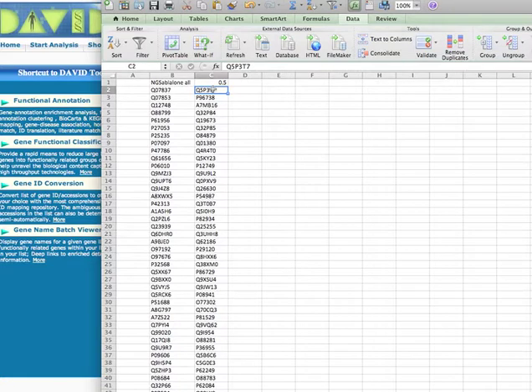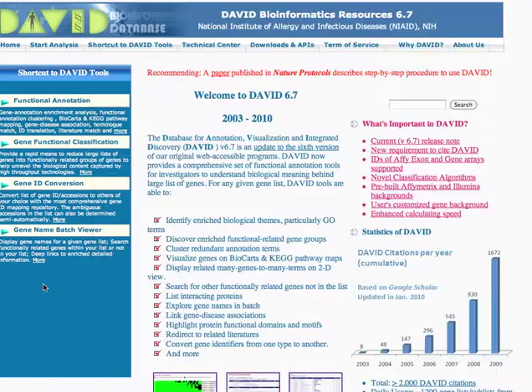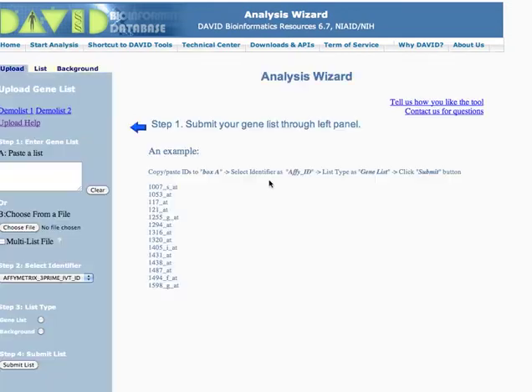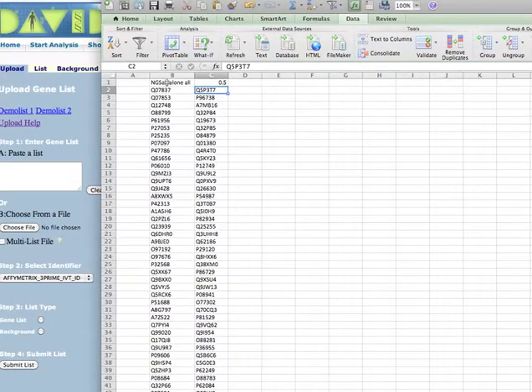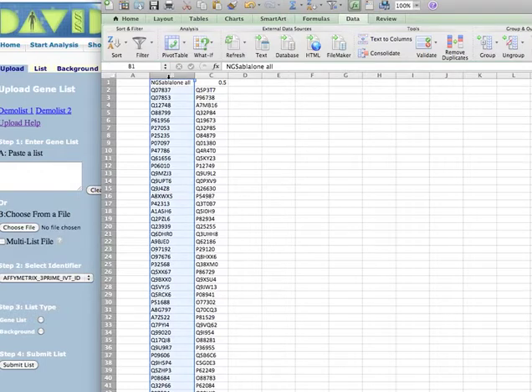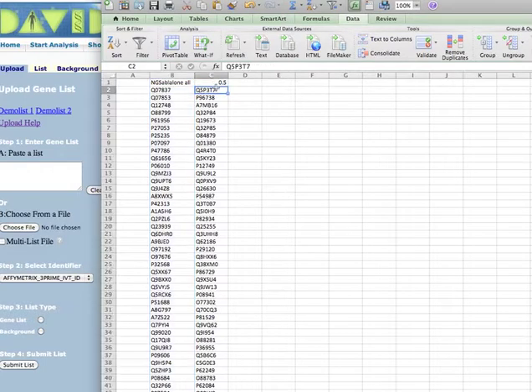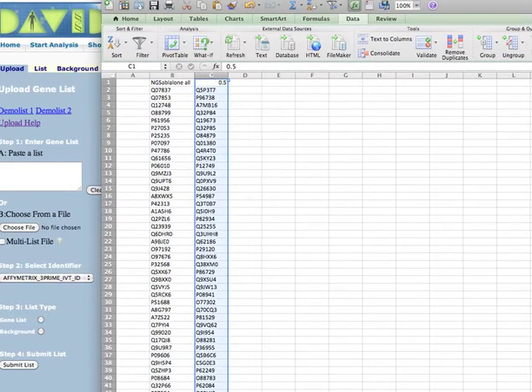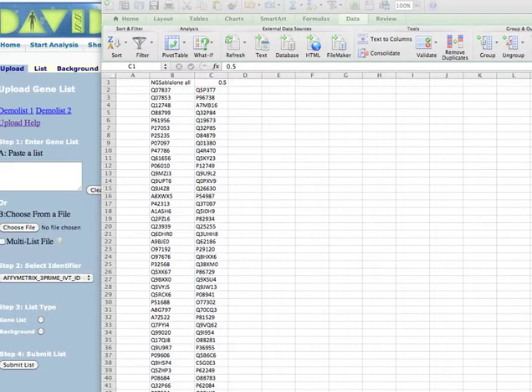So what I'm going to do is I'm going to put this in the software called DAVID that looks for enrichment. Enrichment of genes being expressed.